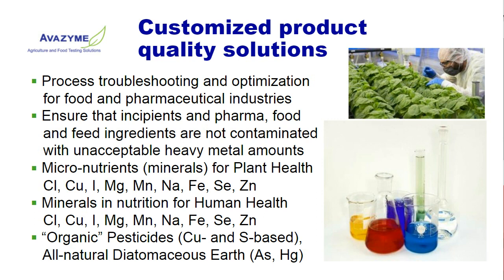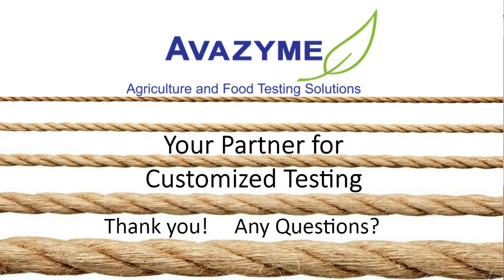So that brings us to the end of our formal presentation. I hope Darren and I were able to give you some good examples of applications of ICP-MS in the various scenarios that we described and the various areas where ICP-MS can be a very valuable tool to provide information about metal content of products, of crops, of soil, water, and other areas of concern.